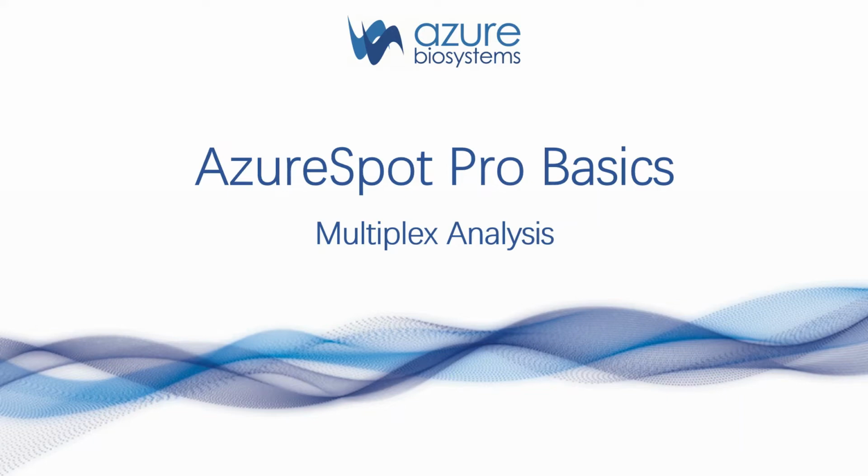Hi, this is Azure Biosystems, and today we're going to cover multiplex analysis using the AzureSpot Pro analysis software from Azure Biosystems.